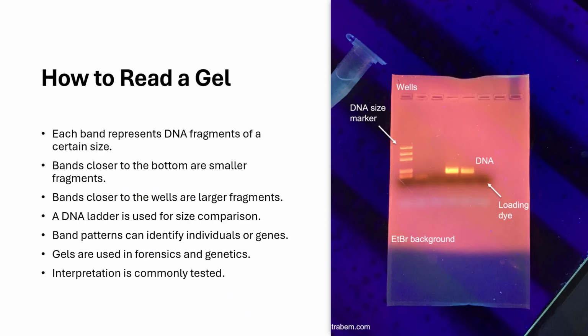Reading gels is a favorite exam activity. Each band represents DNA fragments of the same length. Smaller fragments move farther down the gel. Larger fragments stay closer to the wells. A DNA ladder provides size reference. Matching band patterns can identify samples. Exams expect confident gel interpretation.